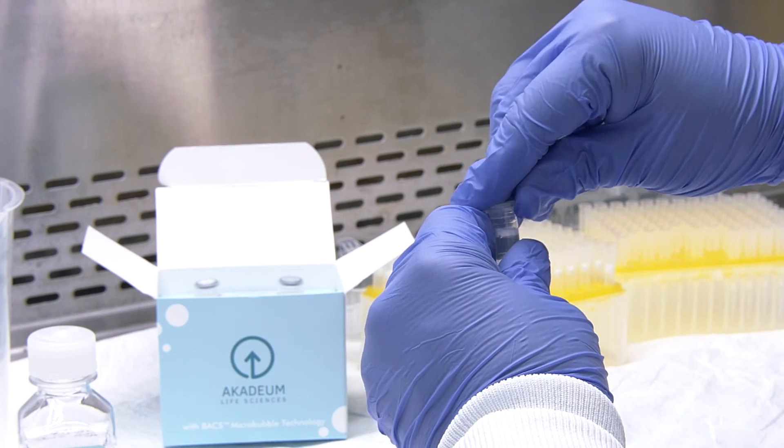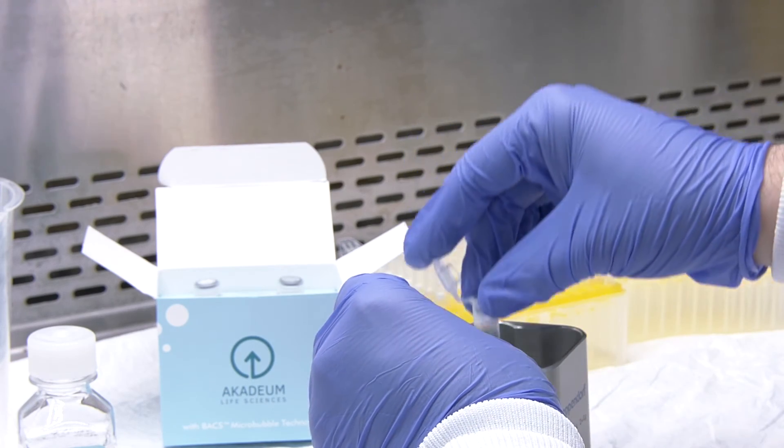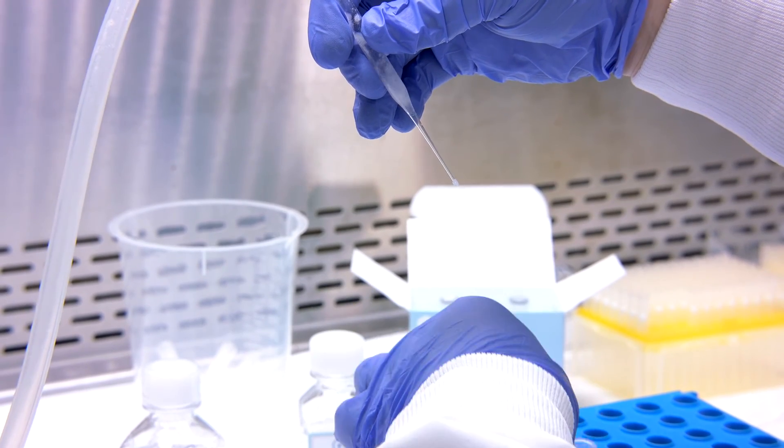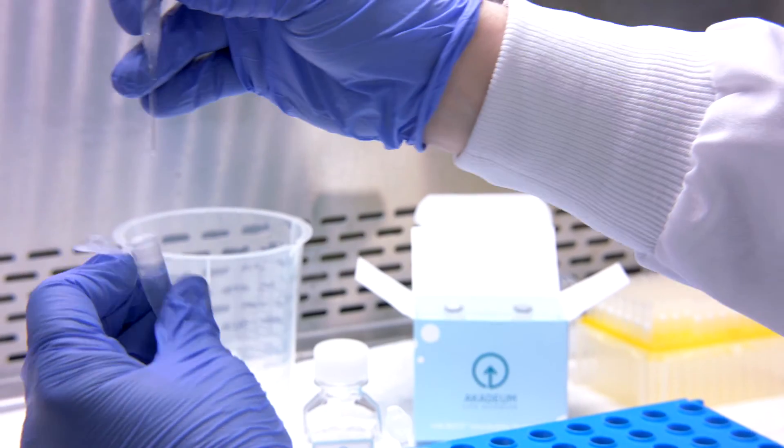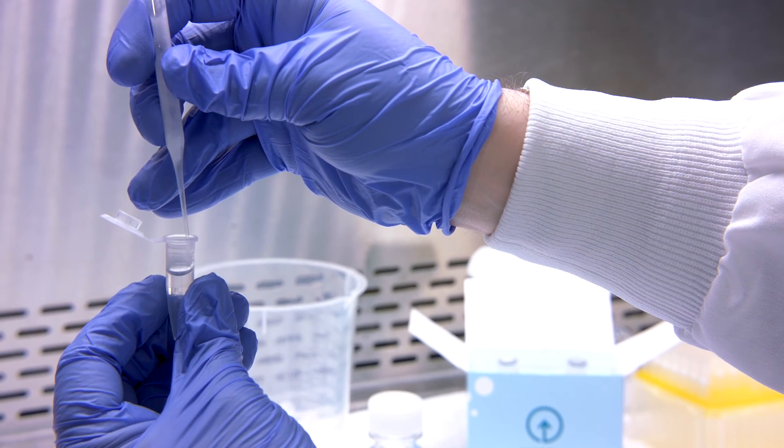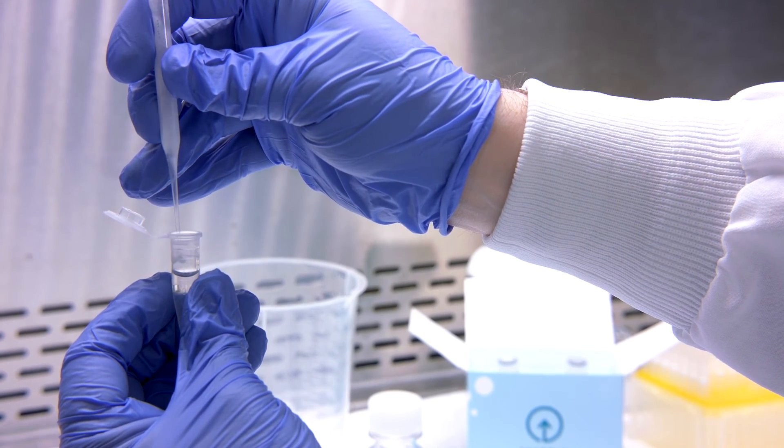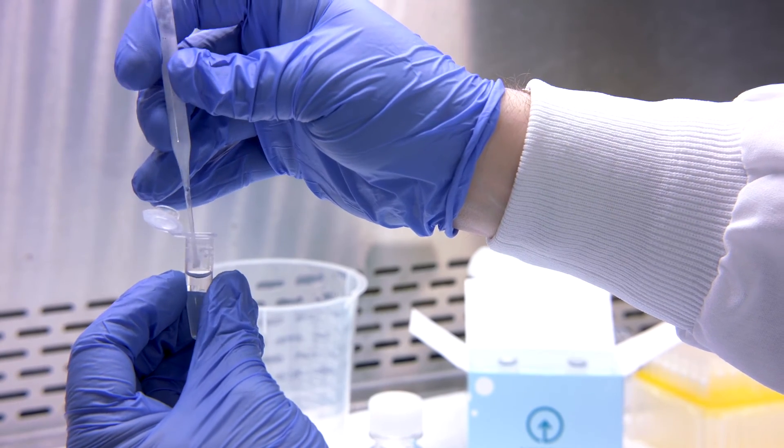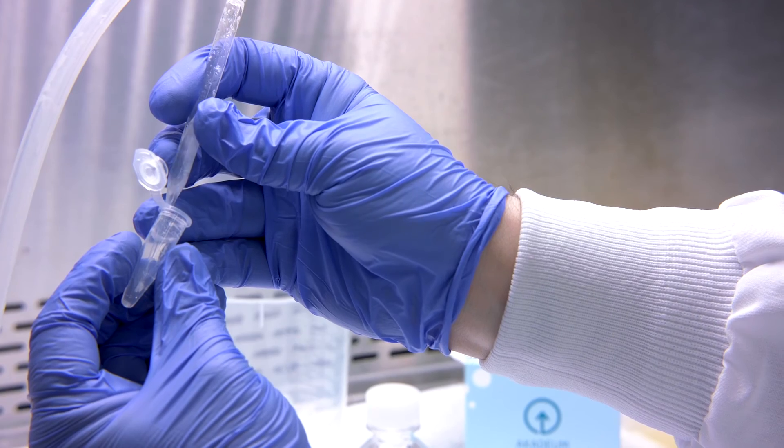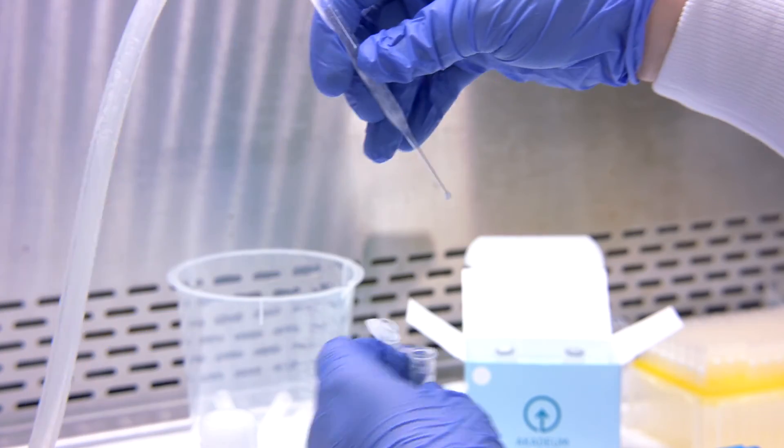We will aspirate the micro bubbles from the top of our samples. Careful not to disrupt the bubbles as you move the tube. Start at the top, aspirate the micro bubbles from the top of the sample, and then remove the rest of the supernatant. Careful of your pellet at the bottom.